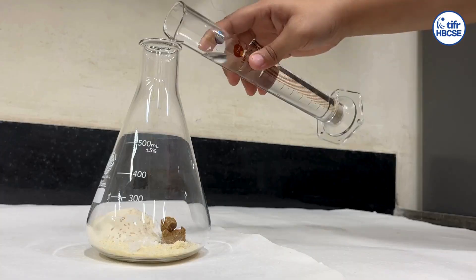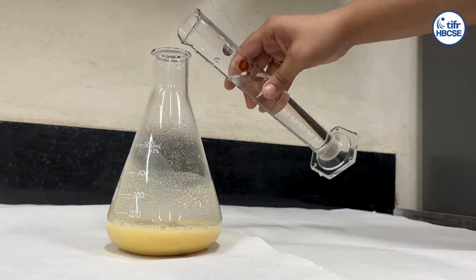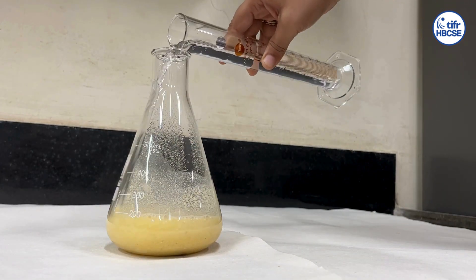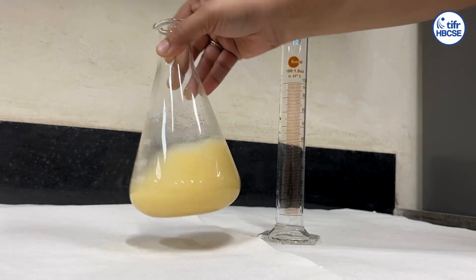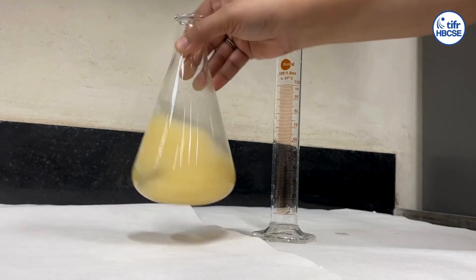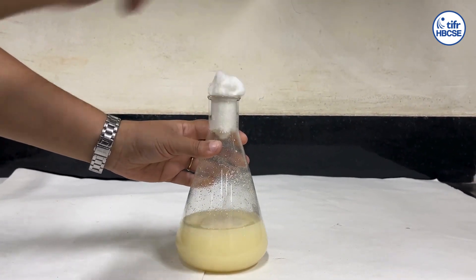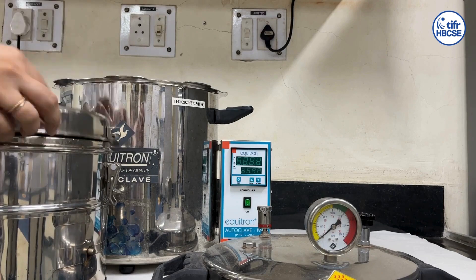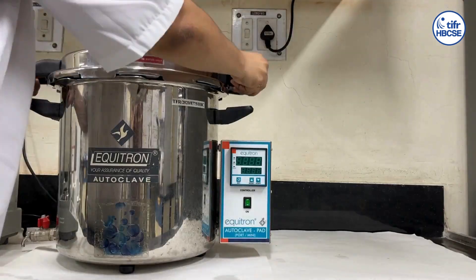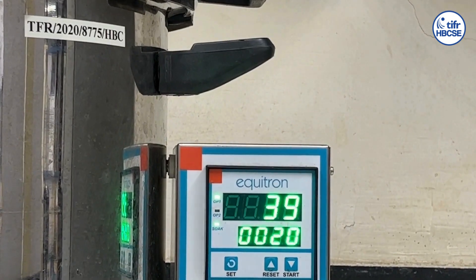Add 300 ml distilled water into the flask, 100 ml at a time, and shake well to mix the contents. Make sure to remove all lumps. Plug the mouth of the flask with cotton and sterilize the food medium in an autoclave at 121 degrees Celsius or 15 psi for 20 minutes.